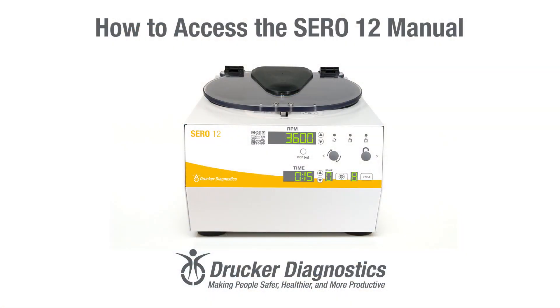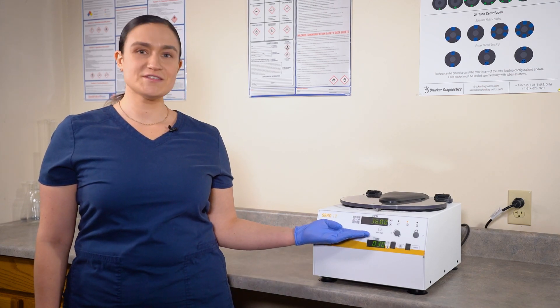How to access the CERO12 manual: your CERO12 has a QR code on its front panel label. This QR code will take you to a convenient owner's portal with a variety of helpful links for your centrifuge, including the manual.